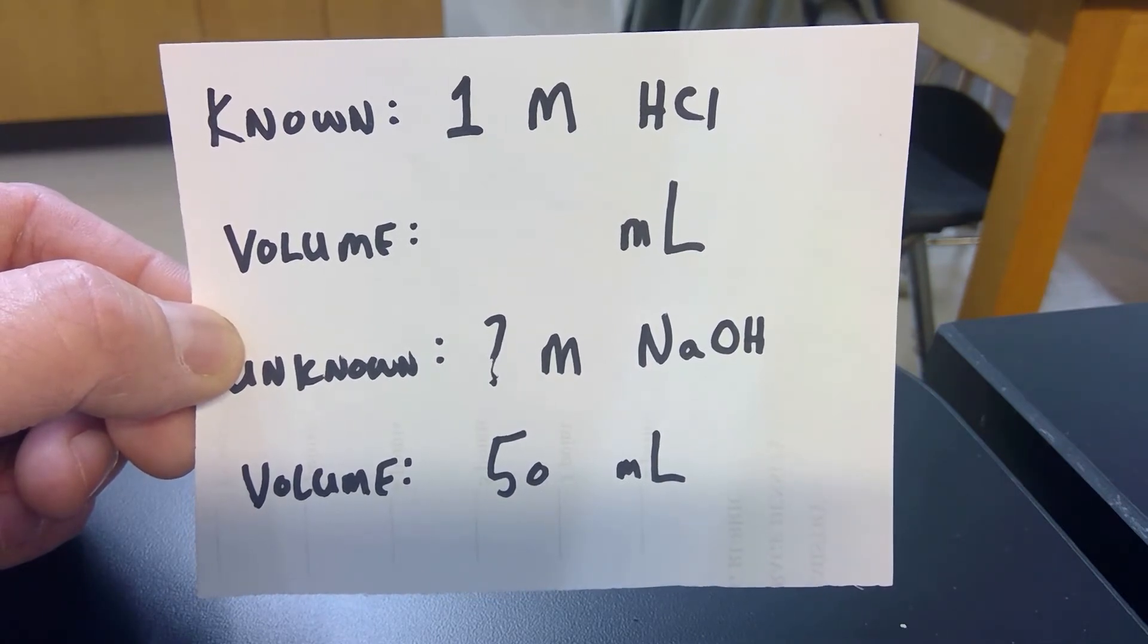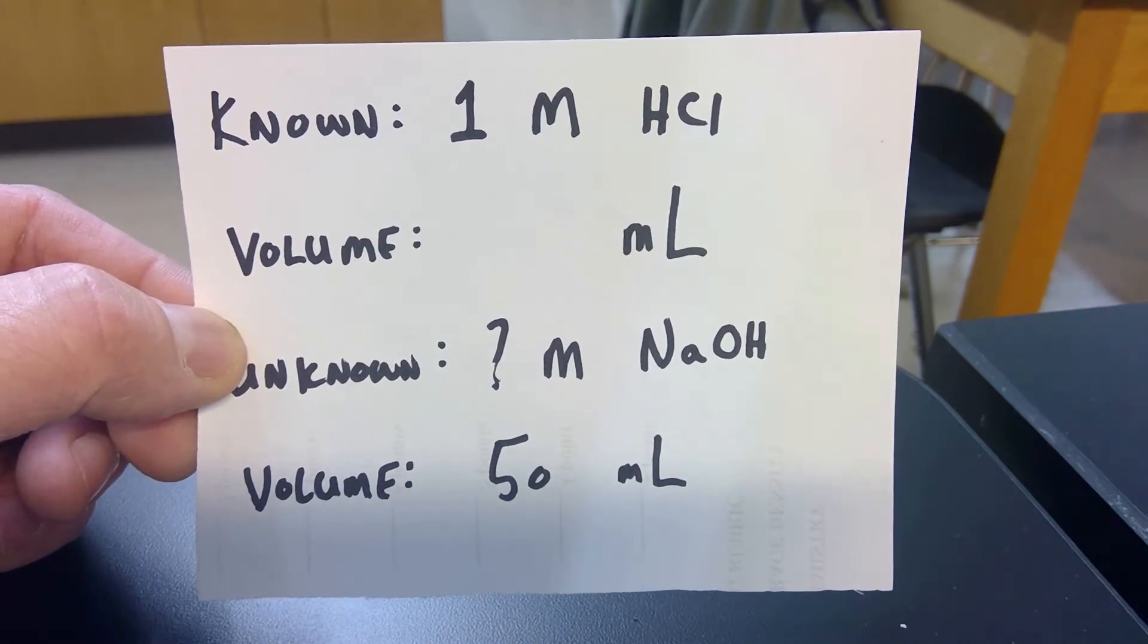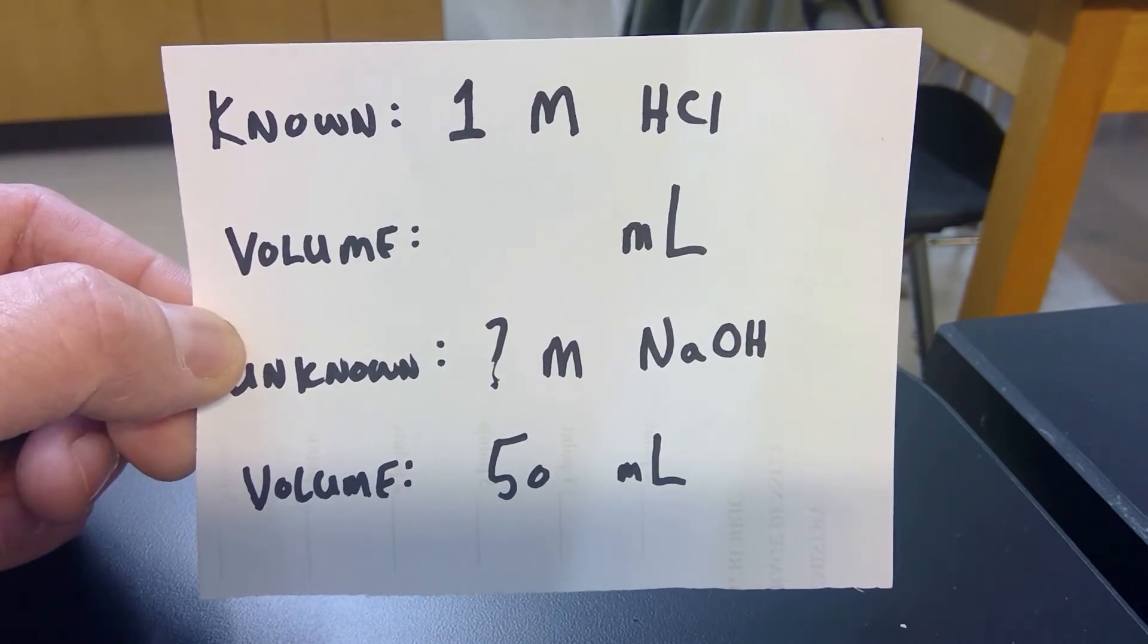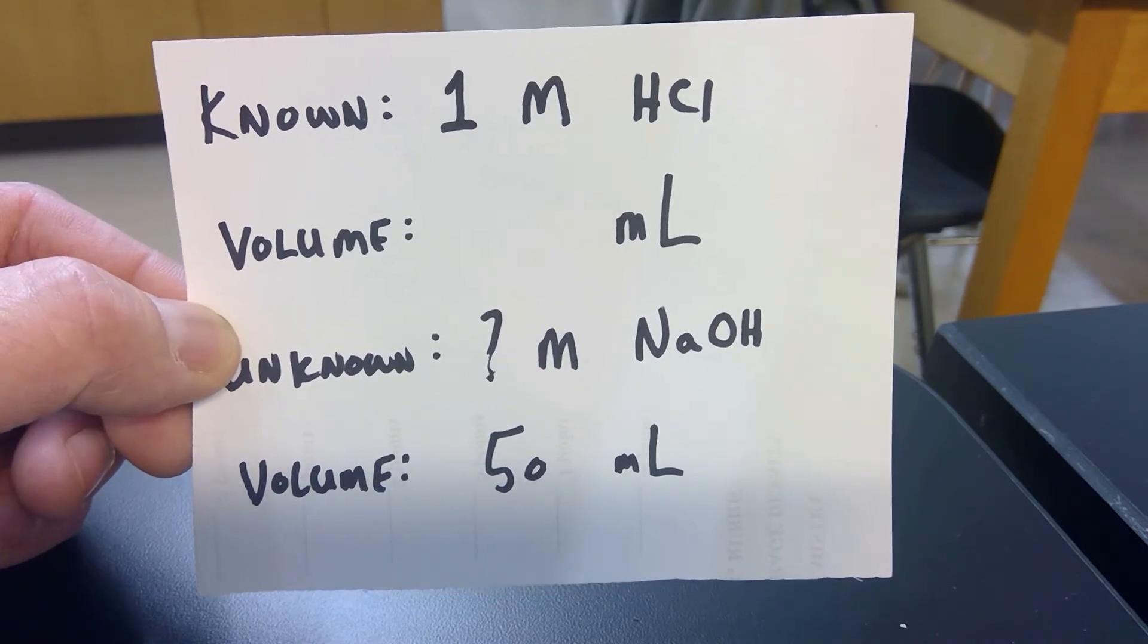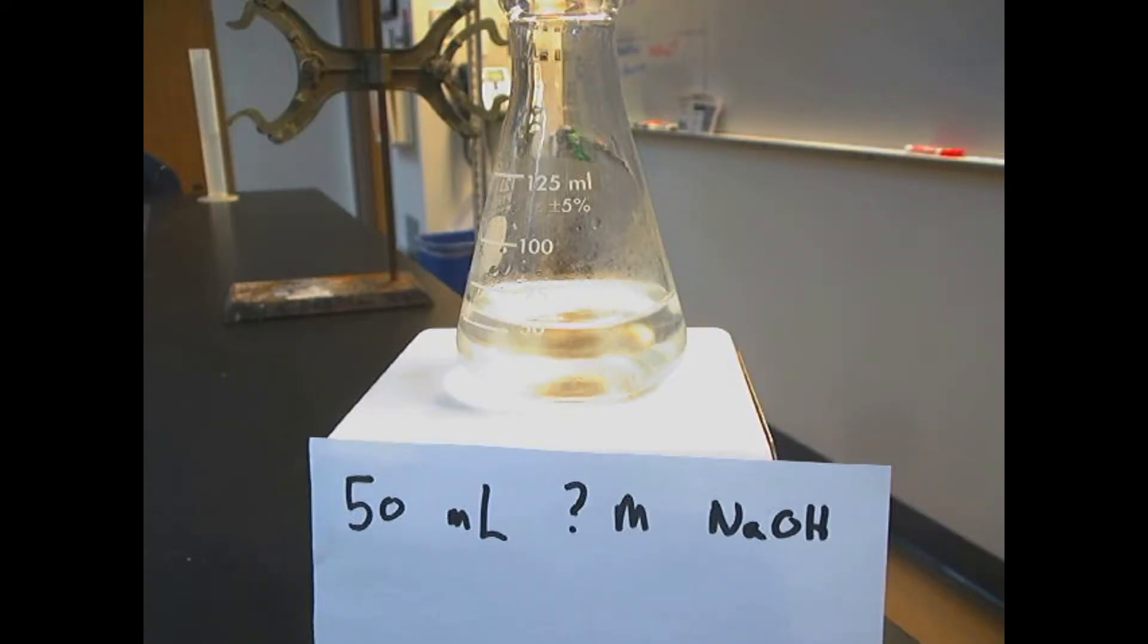We don't know how much volume we need yet because that's what the titration does. We are going to titrate our unknown, which is sodium hydroxide, and I have currently measured out exactly 50 milliliters. So in our flask that is currently being stirred, we have exactly 50 milliliters of unknown molarity sodium hydroxide. We know the volume, we don't know the concentration.